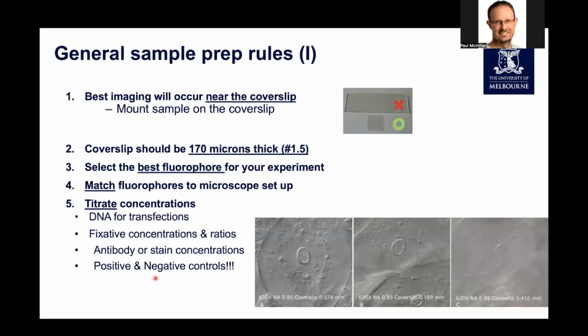Over here on this panel, we've got images taken with slightly different cover slip thicknesses. So here, and here, you can see the image quality starting to deteriorate as our cover slip thickness gets thicker.